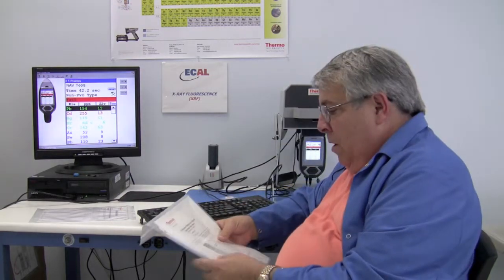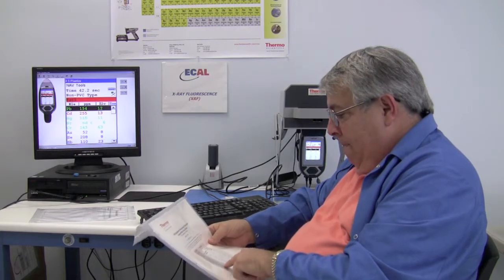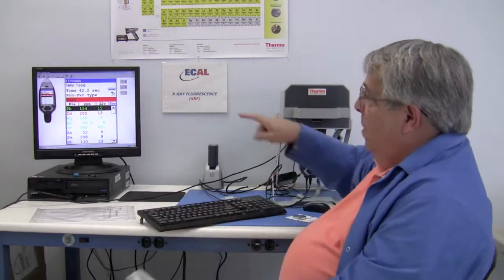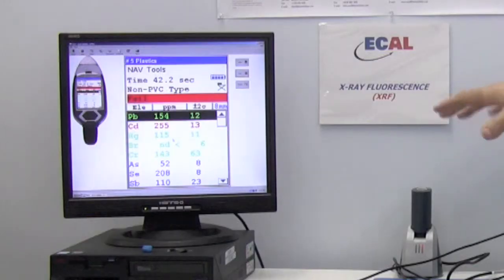So if we look here, the standard that comes with this says lead is 155 parts per million, plus or minus 12. We measured 154. That's pretty good, right?